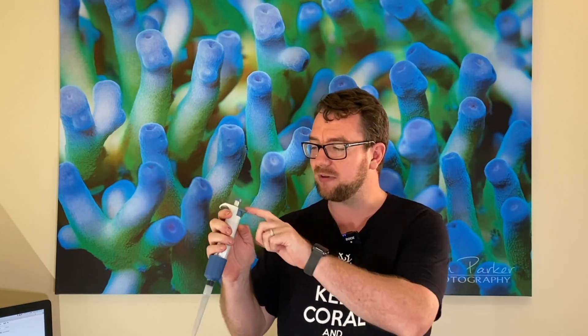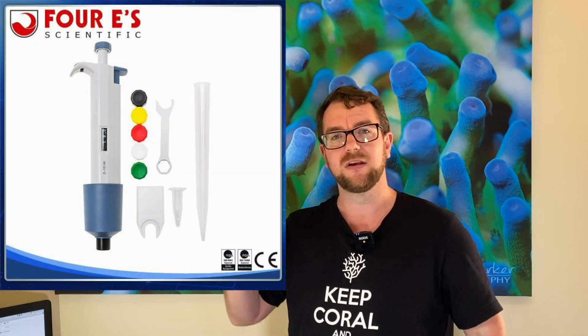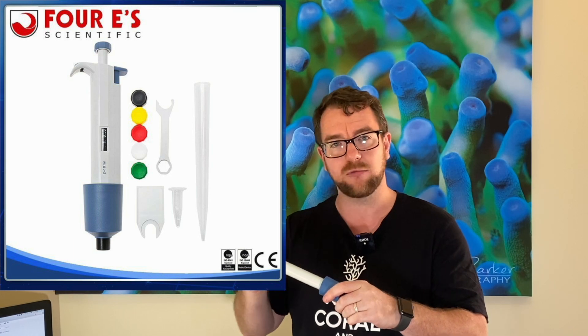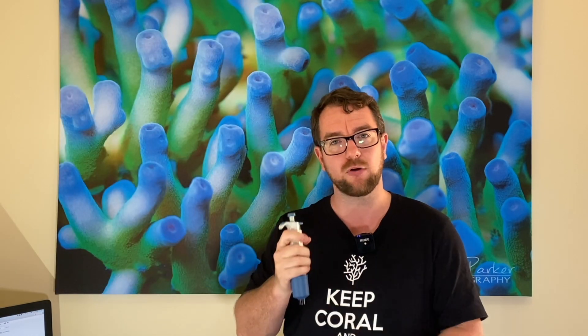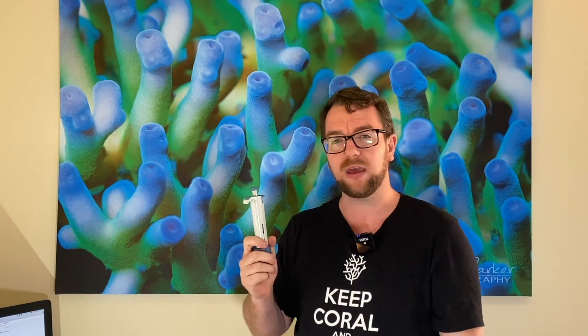The other thing is, if you're worried about getting different waters from one tank to another, you do also have this little quick eject button — when you press that, the tip comes off and you can have multiple tips for different tanks. You can also get different colored caps, so if you want to keep a different colored cap per tank you can swap them out for quick reference.